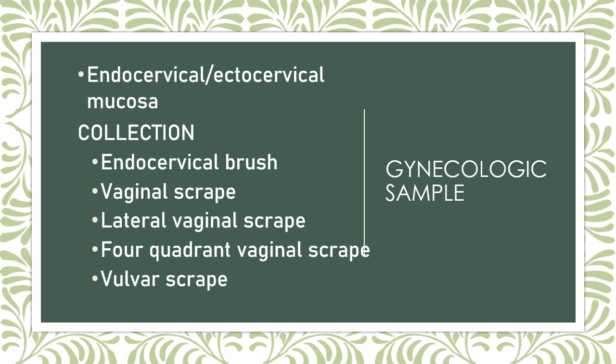Your sample should include squamous cells, columnar cells, and metaplastic cells, and of course neoplastic cells, in case there are any. Collection is via brushing. You have your endocervical brush for samples of your endocervical canal.